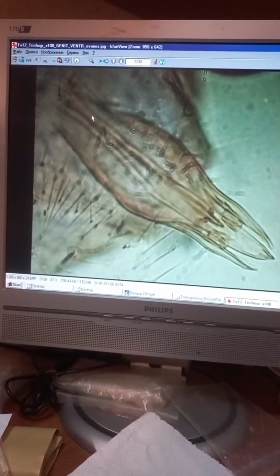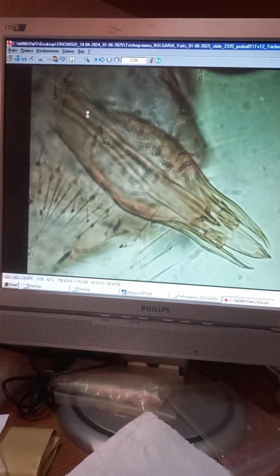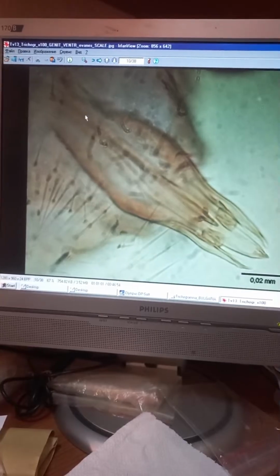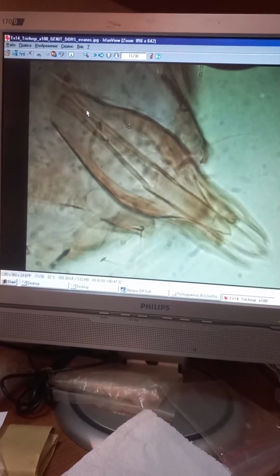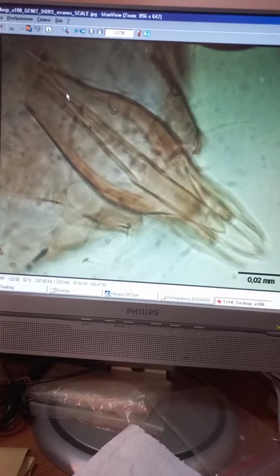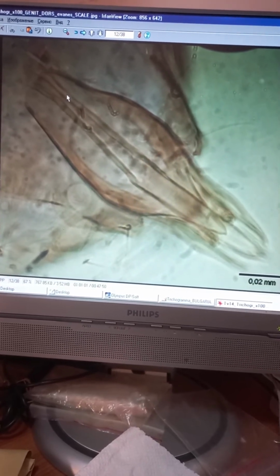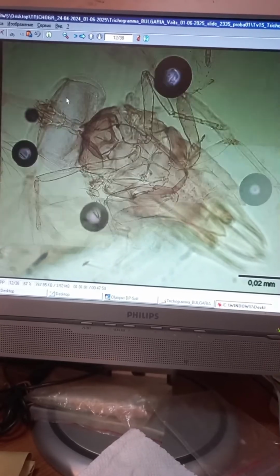Male genitalia with intervolsellar process or ventral process of phallobase. Ventral process. Under different light and contrast. And here, dorsal aperture of phallobase. Little bit up. You need to change position of microscope focus up and down.